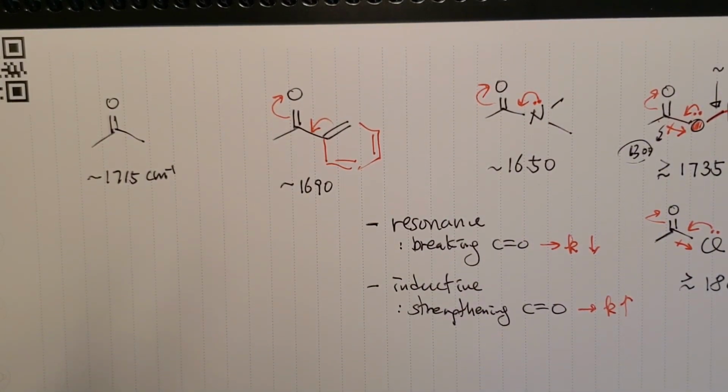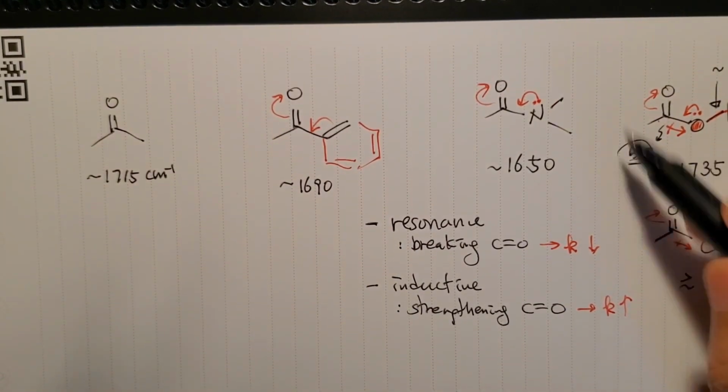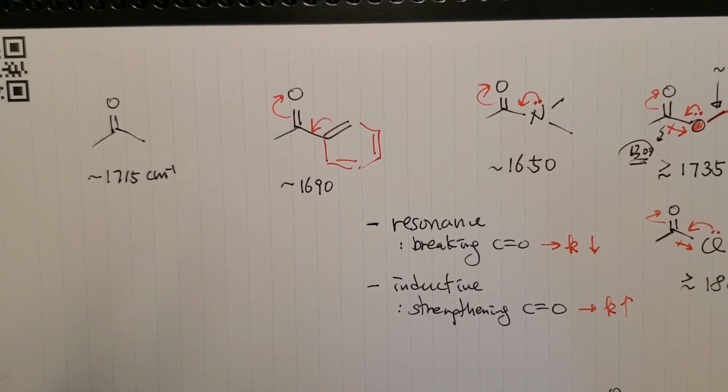So if you see a strong, intense signal around 1000, that's supposed to be a single bond, then you can search for a 1300-ish intense peak. That will give you an idea that indeed you have an ester. So in order to identify an ester, you have to compare not ketone but ether.